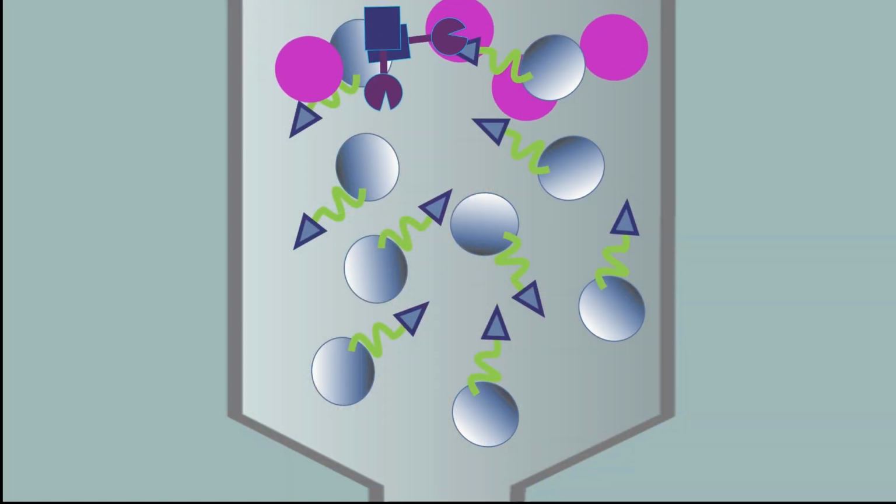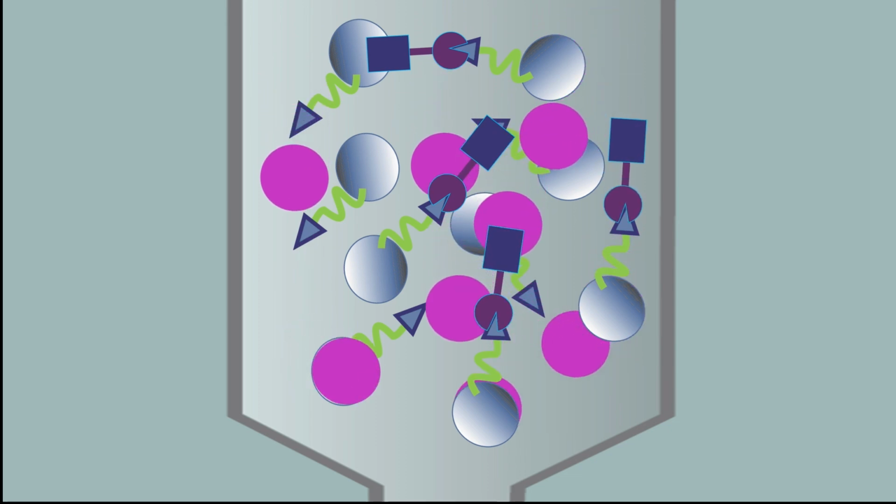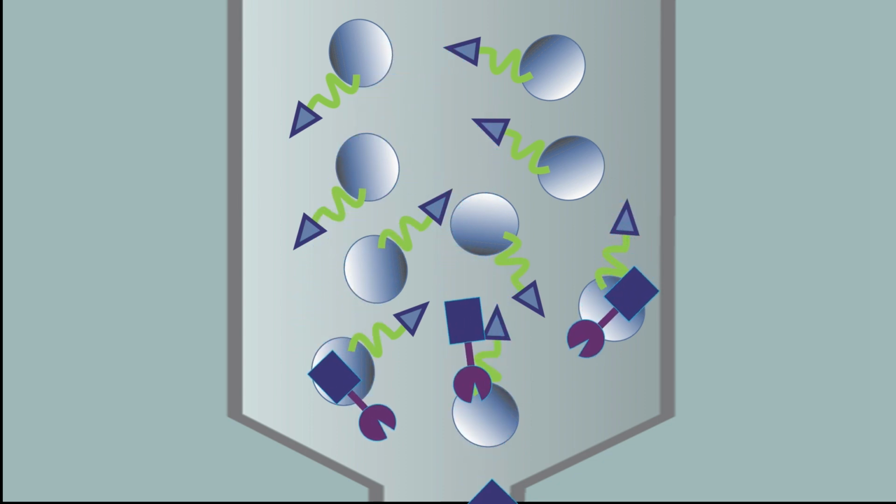Here's how it works. GST binds to glutathione conjugated beads in a column, and then you can wash away all the junk proteins. Then adding free glutathione elutes your nice purified GST fusion proteins. But GST isn't always a perfect solution. It has a couple of quirks.